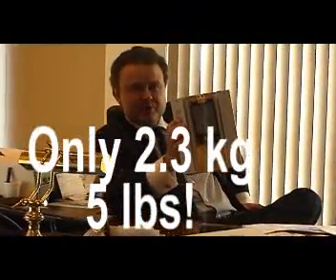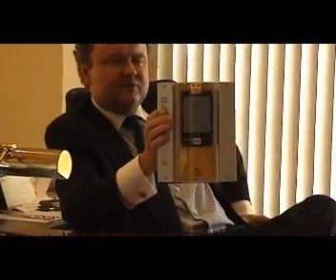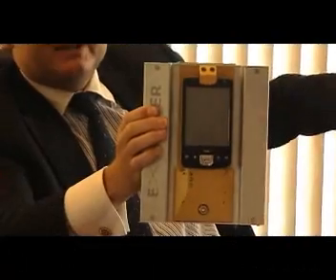Why is it portable? Because I can hold it with one hand — it's only 2.3 kilograms. It's portable because it has a battery lifetime of about 15 to 20 hours, which is really amazing.